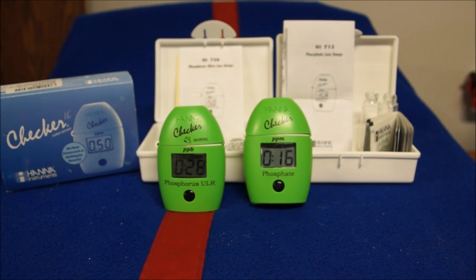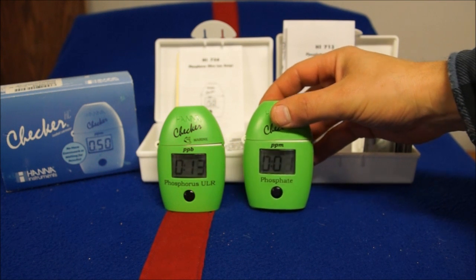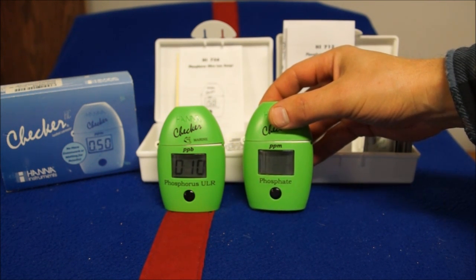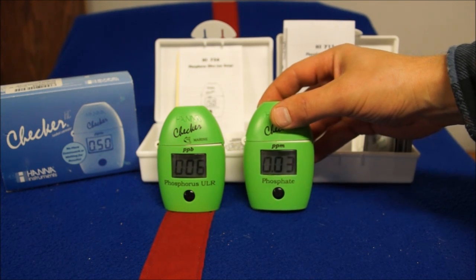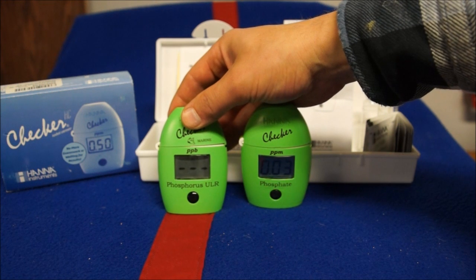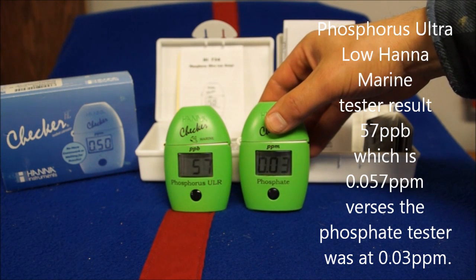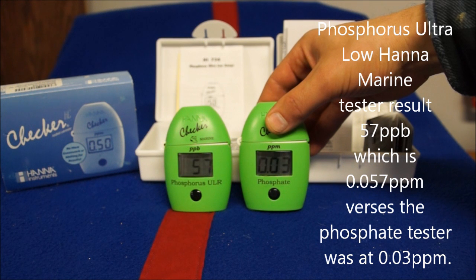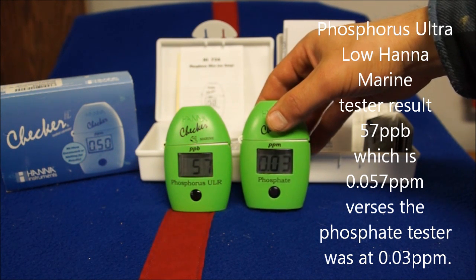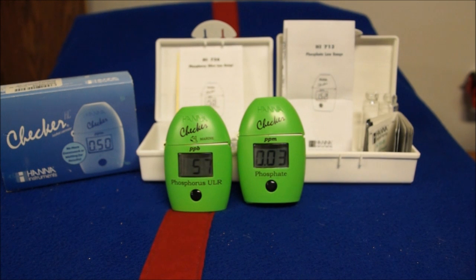Since both tests are easy to run and people have a choice of which to buy, when it comes to the marine aquarium — not freshwater — I have my clients invest in the phosphorus ultra low checker versus the phosphate checker. Here are the results: the phosphate checker gave us 0.03 parts per million. The ultra low phosphorus checker measures in parts per billion and gave us 57, which equals 0.057 parts per million — almost twice as much phosphorus detected compared to the phosphate ion checker.